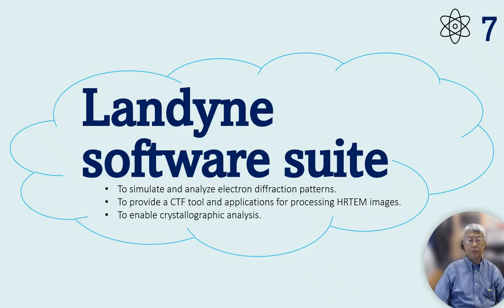Landyne software suite is a set of practical tools for various aspects of TEM work. The current release, version 6, includes 16 applications, all compiled using the latest version of OpenJDK.